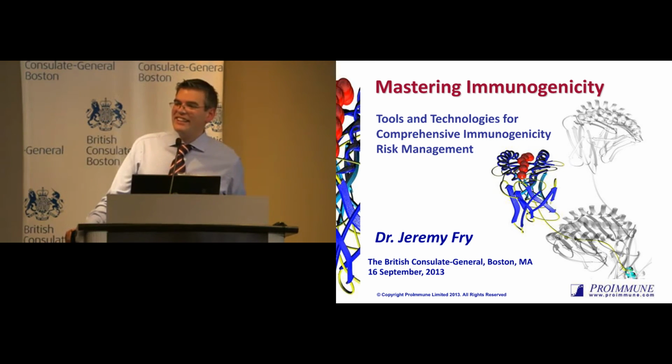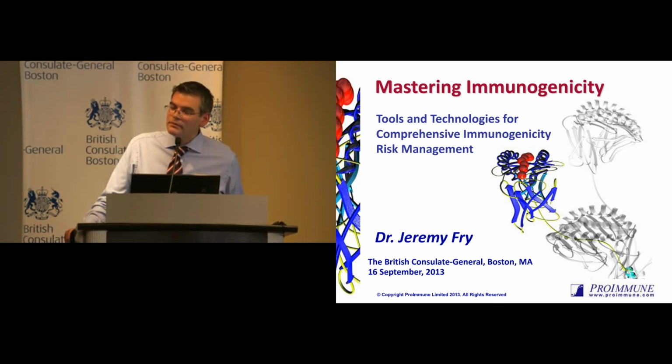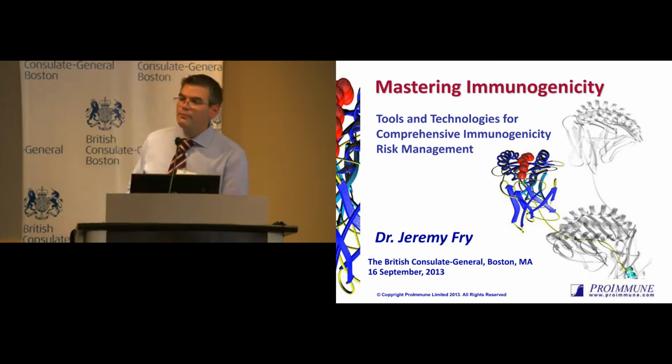It's working. Okay. I had two questions. The first question was on your DC T cell assay. You said that you mature the DCs. I was wondering if you see how molecules with low rates of clinical immunogenicity behave in that assay, and if you see an over-presentation of molecules. If you see a molecule like Xolair that has a very low rate, is that over-presented in that assay?